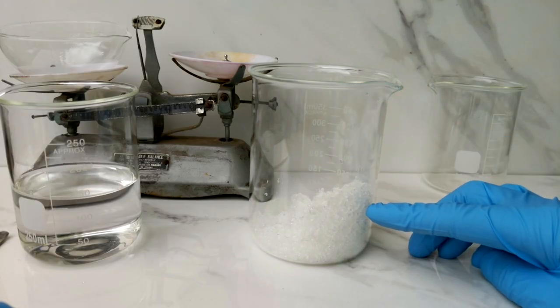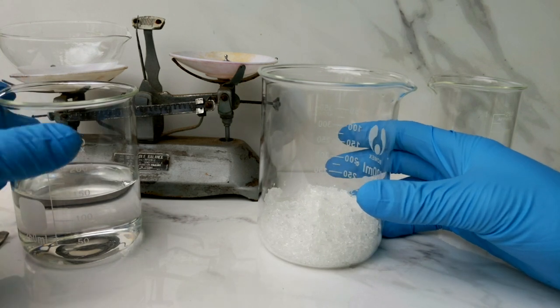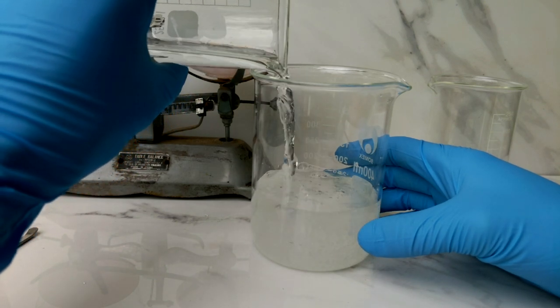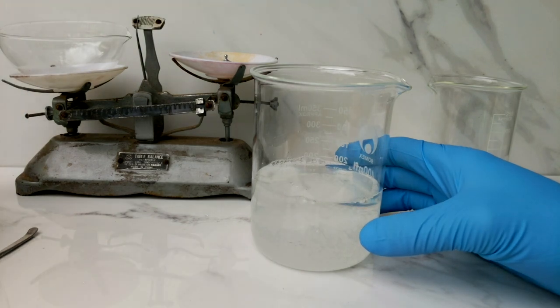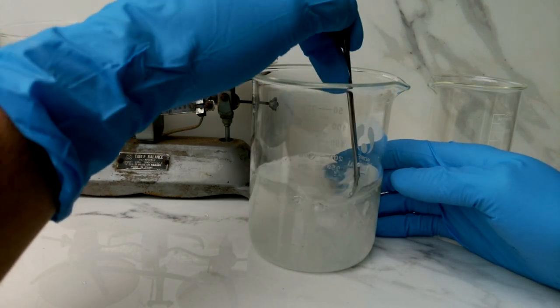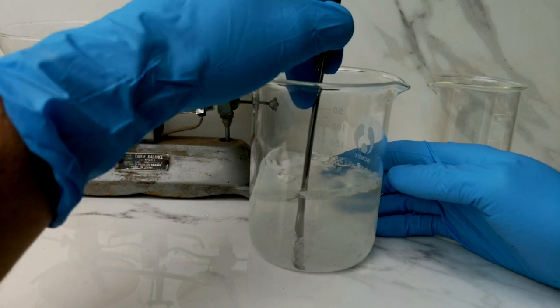So here in the beaker we have our cadmium nitrate crystals — approximately 100 grams — and to that we're just going to add some water in order to dissolve it and make a fairly saturated solution of cadmium nitrate. We just have to stir this to get all the crystals to dissolve. Given that the liquid is cold and should end up quite saturated, this may take a little bit of time.